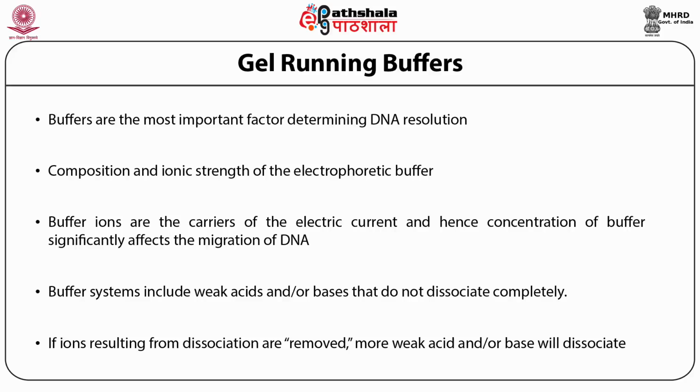The buffers used contain EDTA to inactivate many of the nucleases that could be present in the experimental setup, which require a divalent cation for their function. The EDTA chelates this particular cation, thereby decreasing the effect of the nucleases on the DNA.